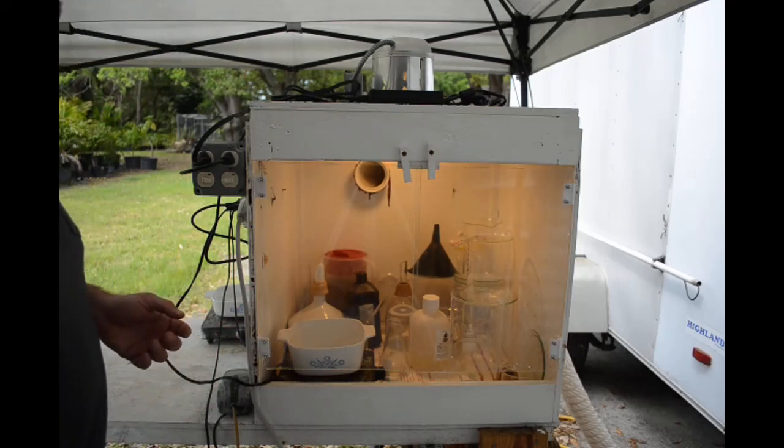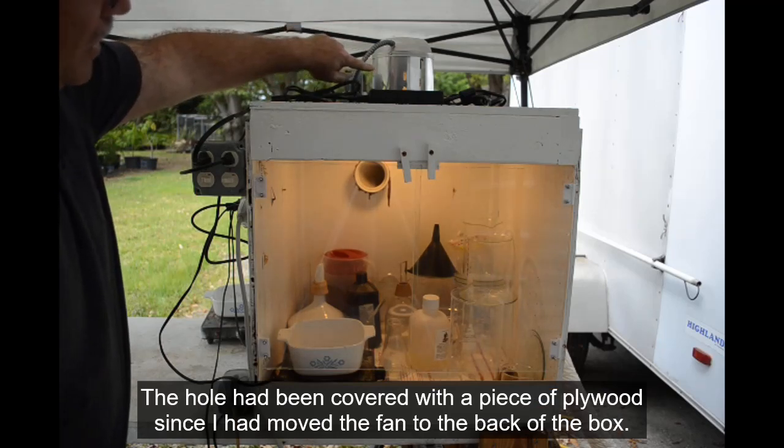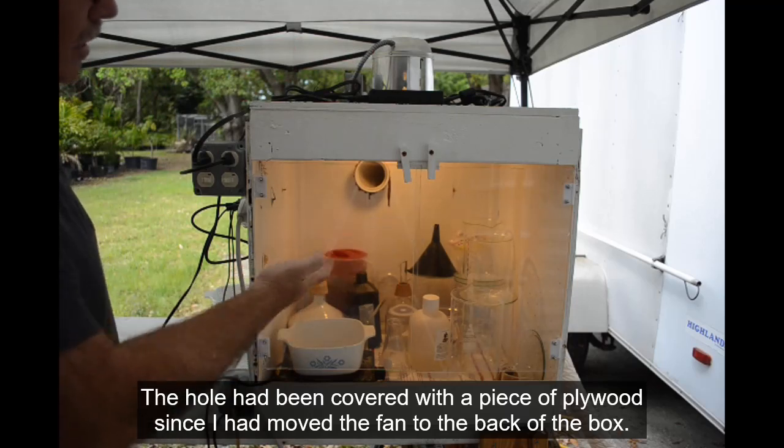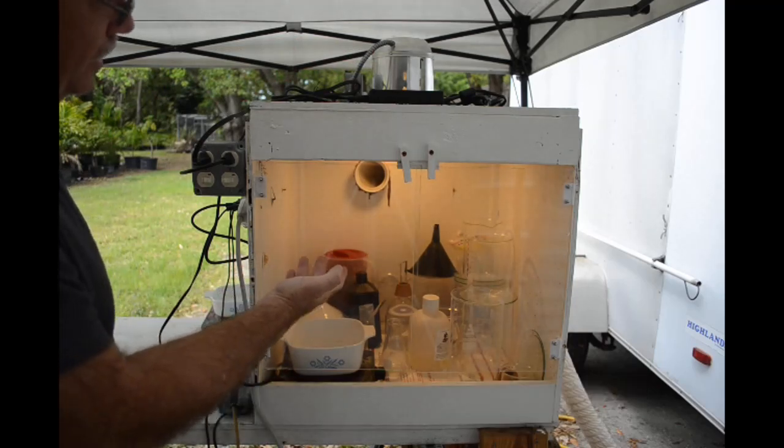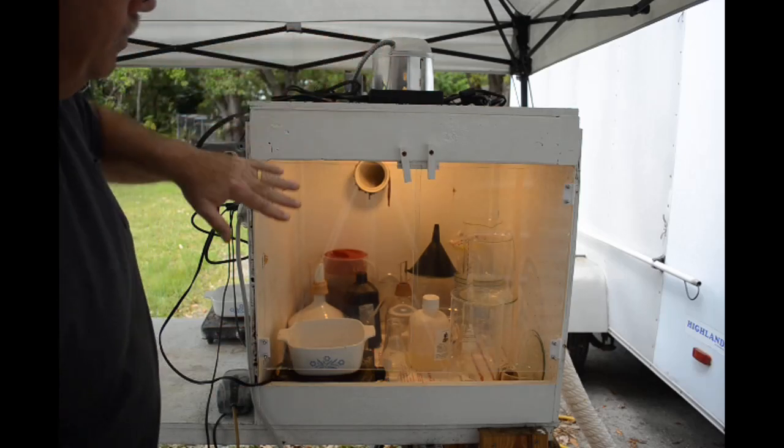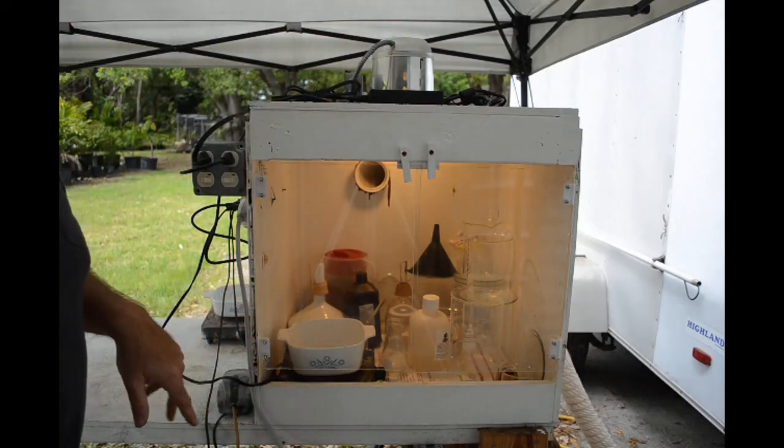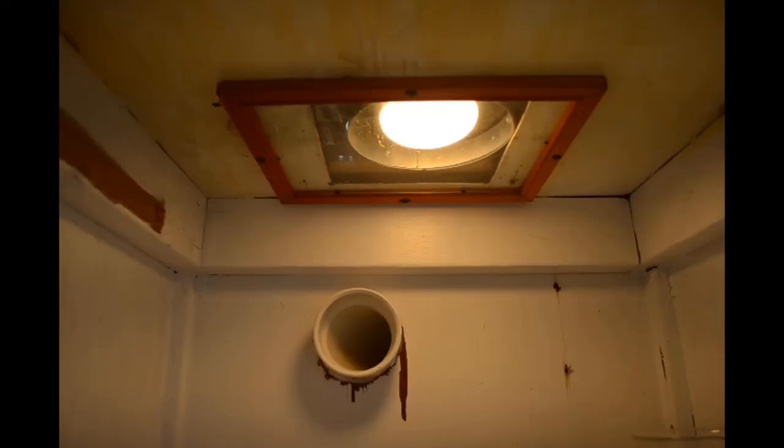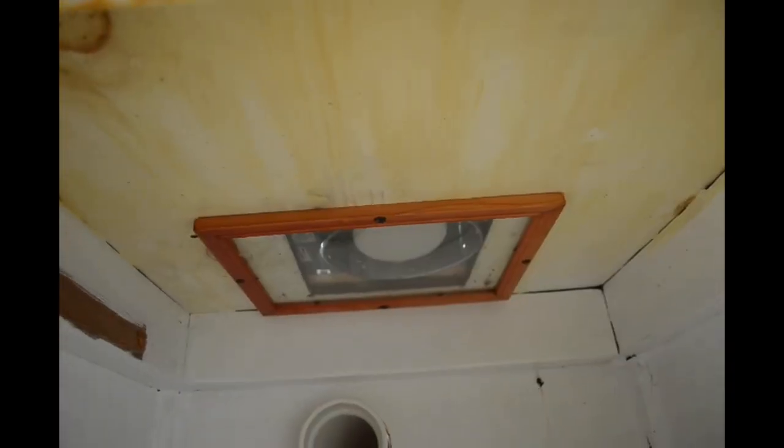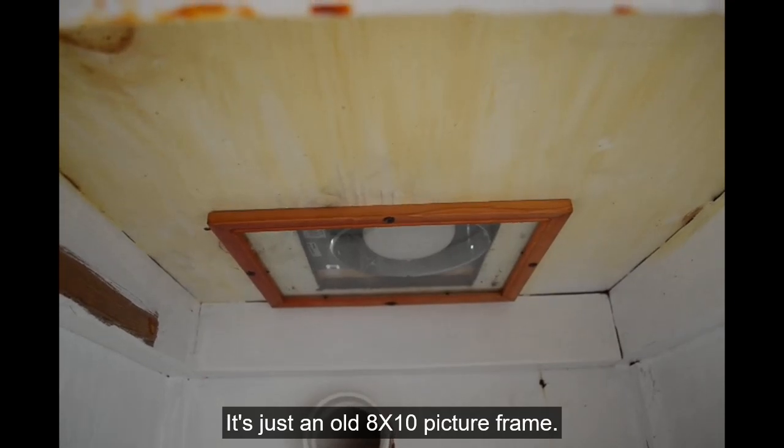I thought about explosion proof lights but they're all made of metal that's going to be rapidly attacked by the chemicals. So I thought, I've got this hole in the top, what if I just mount a light up here above the top of the fume hood and then put a sheet of glass in there for the light to shine through.